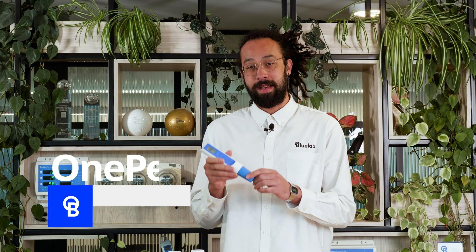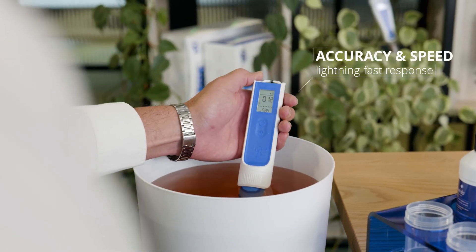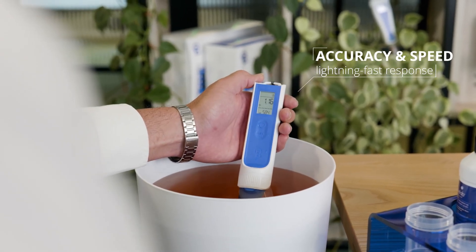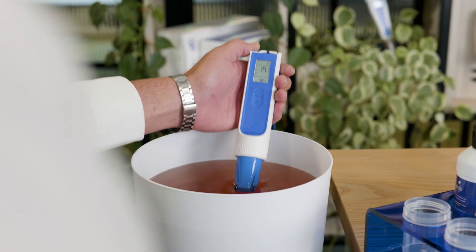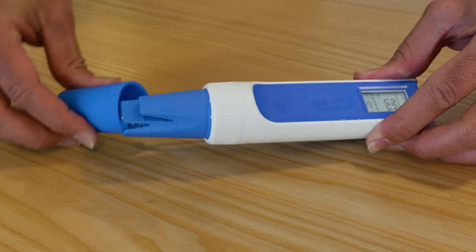Let's dive into the features that make the One Pen a cut above. Unmatched accuracy, lightning fast response time and superior stability. Premium design, crafted from the highest quality materials for exceptional performance and durability.